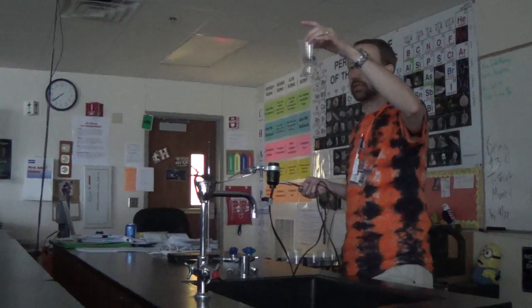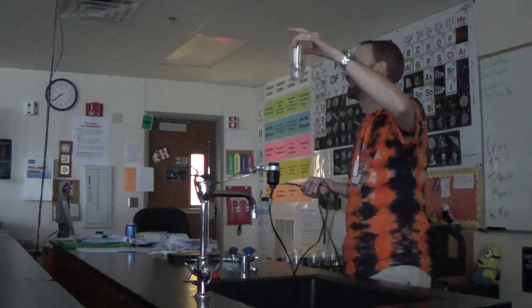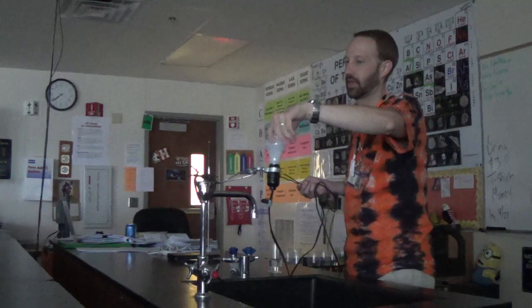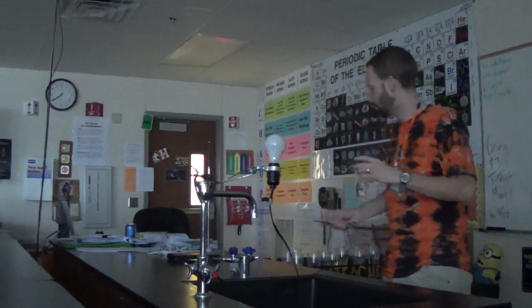So ethanol is ethanol. What's dissolved in ethanol? Nothing. Let's find out. Here's my 34 watt bulb. It does work. Let's try it. Boom. Ethanol is pure, like our pure water with nothing dissolved, and there's nothing to ionize, there's nothing to transmit that current.